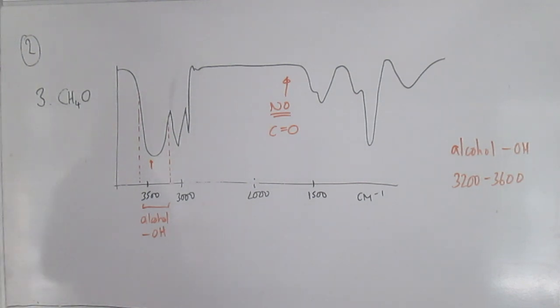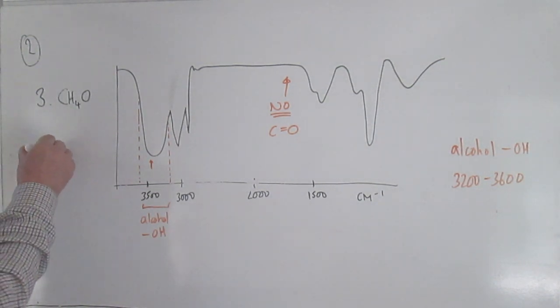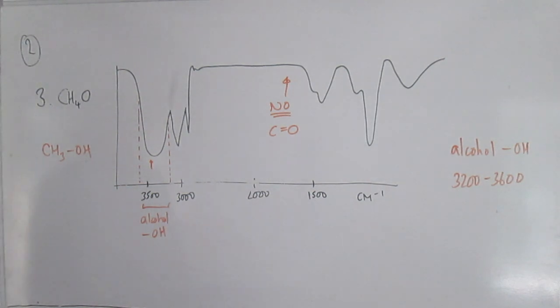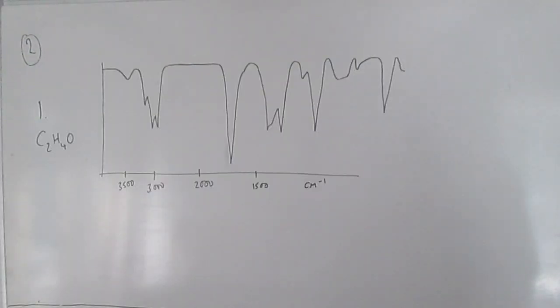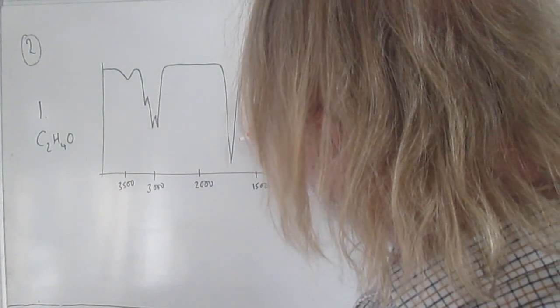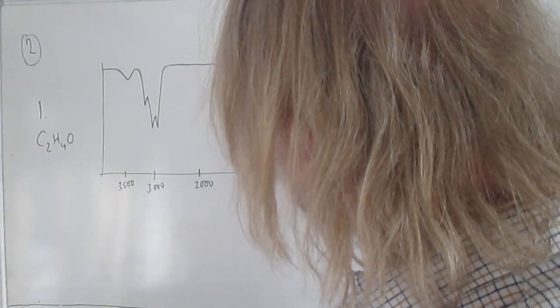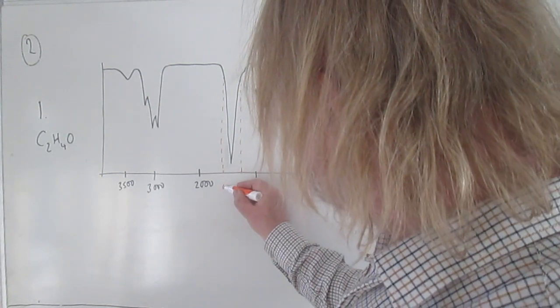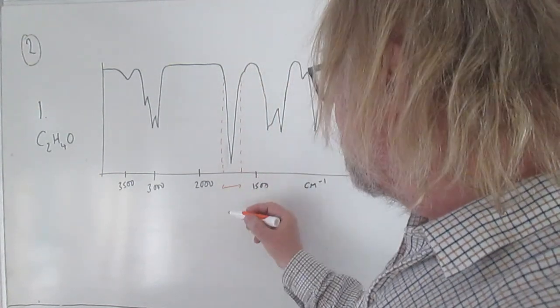So what we've got from that is that it's an alcohol which fits that formula, and obviously again, because it's such a simple thing, there's only one candidate, which is that that's methanol. So now that we know what OH peaks look like, it's worth just looking back at spectrum 1 again. We had already identified the C double bond O peak. Remember that with your set square you had verified that that fitted in the expected range of 1630 to 1820.